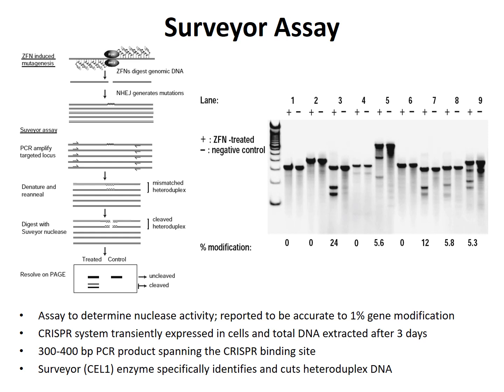And so here's some examples over here using zinc finger nucleases, where here you can see in the control, where you don't use a nuclease, you get no heteroduplex formation and no cutting of your PCR product. But then when you do have indels and heteroduplexes, you see these smaller bands from those being cleaved, and then you can use densitometry and quantify that.